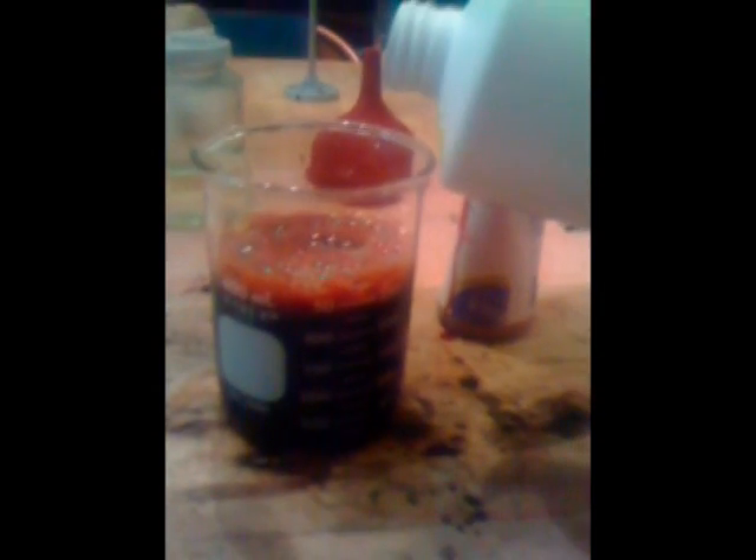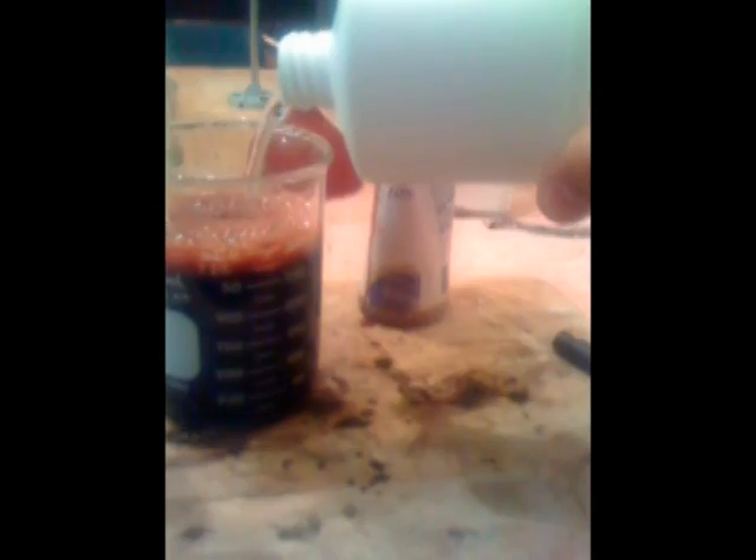Next we are going to add some 35% hydrogen peroxide. Then we're going to slowly add some hydrochloric acid drop by drop until we get this started.